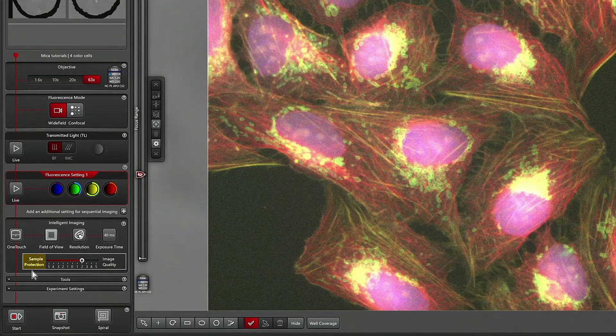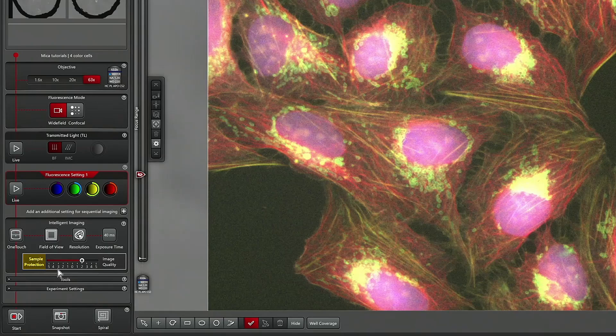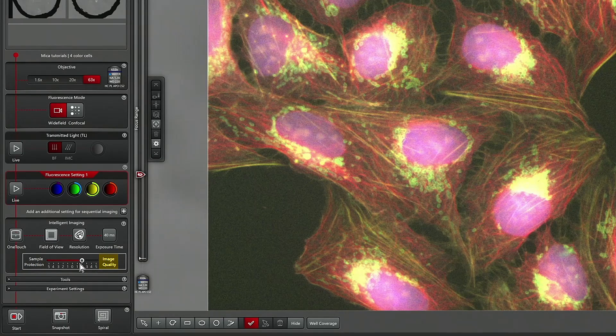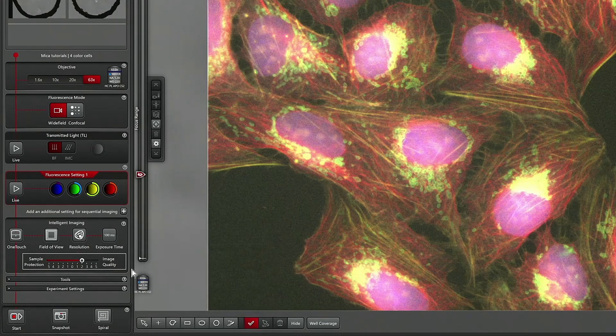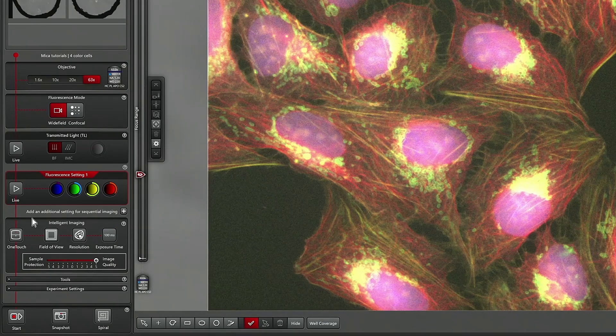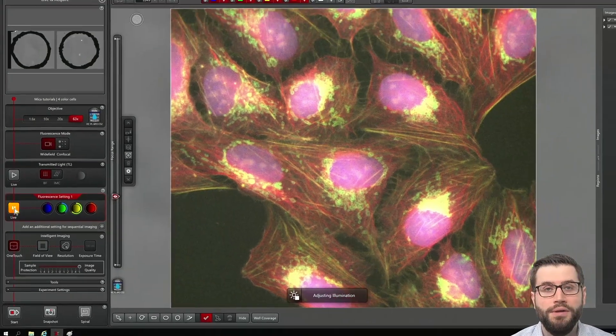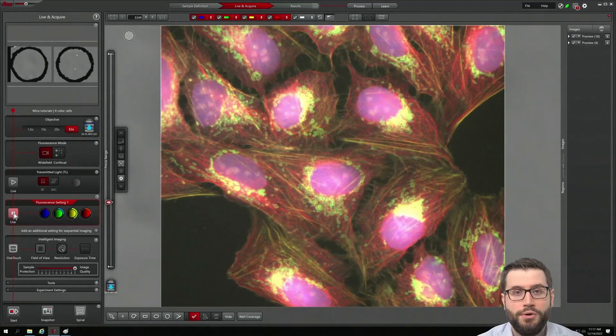You also have a slider that ranges between sample protection and high image quality. So if you want to adjust your imaging parameters, simply select a different exposure time, a higher image quality, and click on live and Mika will automatically adjust the imaging parameters for you.